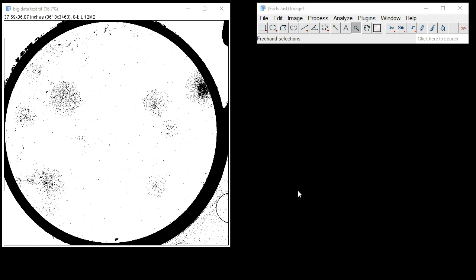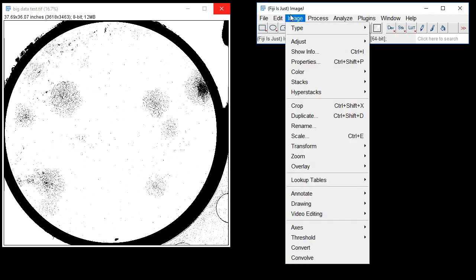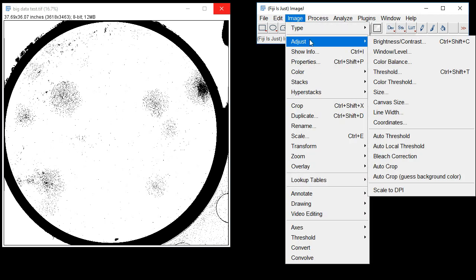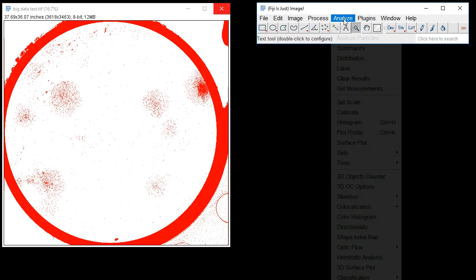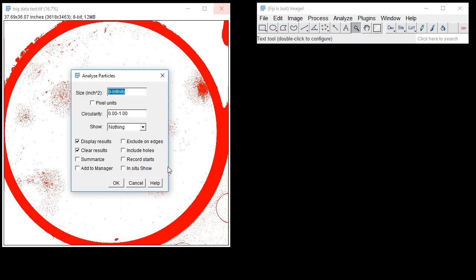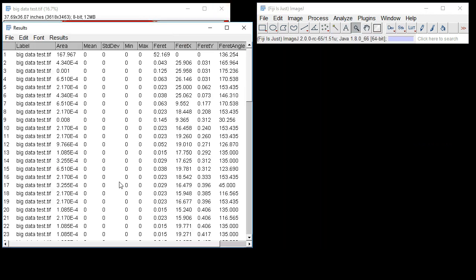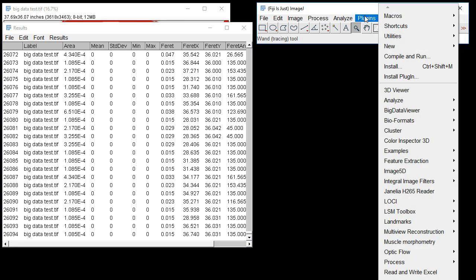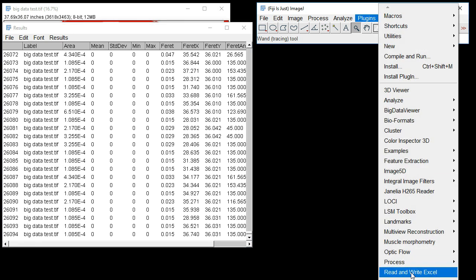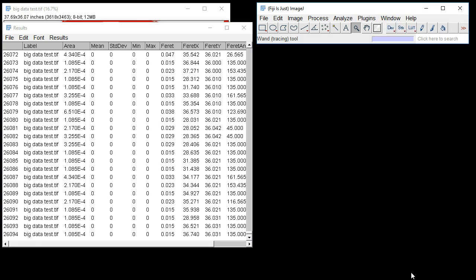Jumping straight in, I'll first generate a results table with a simple threshold analyze particles analysis. We can implement the plugin as in previous releases by simply going to Plugins, Read and Write Excel.